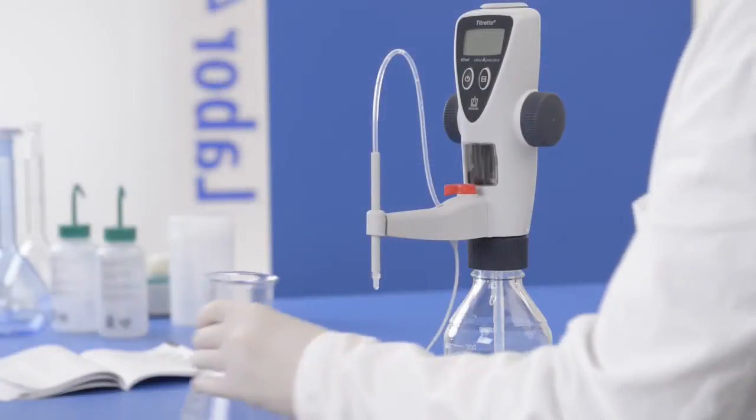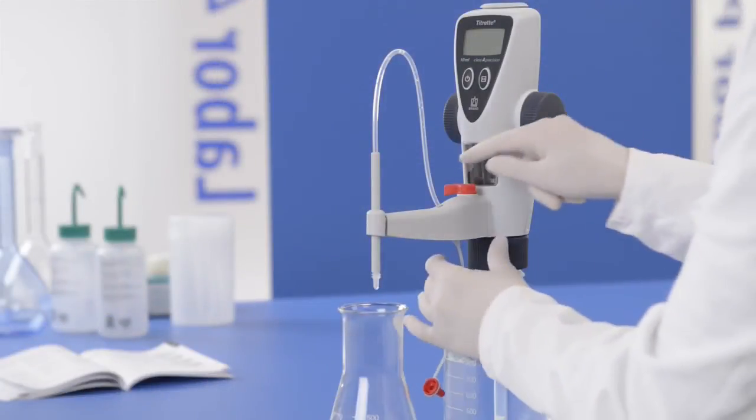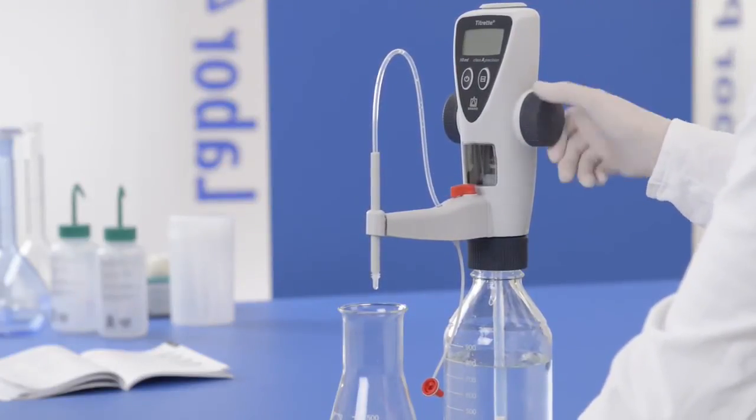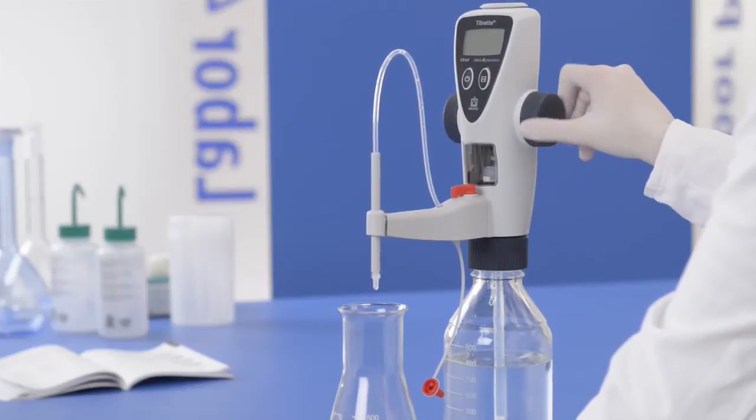If bubbles can still be seen in the titrating tube, it must also be primed. To do this, set the valve to 'Titrate.'